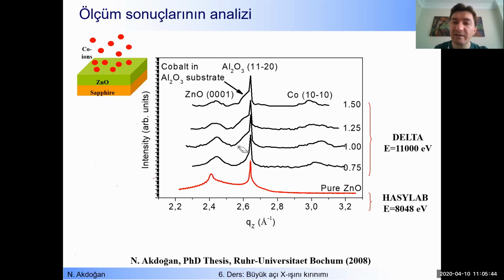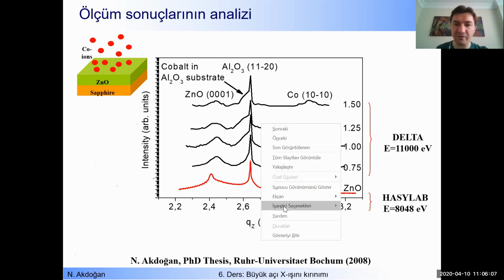And we did not damage the material, okay? Because this method is non-destructive. So this is the power of the X-ray diffraction method, okay? You can get a lot of information just by doing 5 measurements. Very few methods can give you that information, okay? For this reason, X-ray diffraction is very useful.